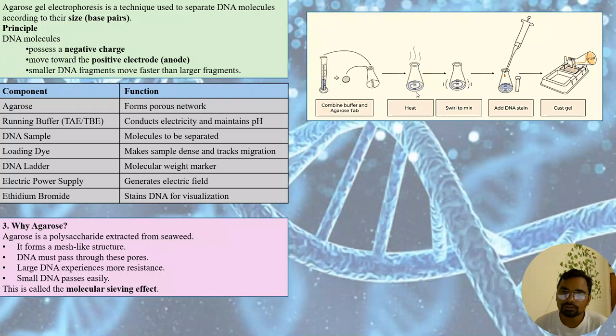This is the process we follow for casting the gel. This is the TAE buffer and this is the agarose gel powder.